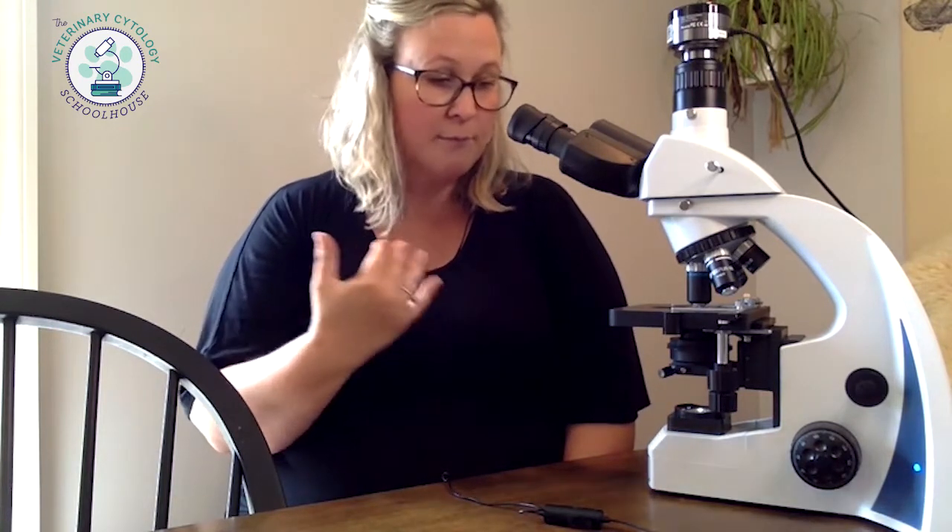I would definitely use this microscope myself, certainly in a clinic setting, but I'm kind of tempted to buy this for my house too. I really like it and I'm going to tell you what I like about it so you can make a good decision for yourself in clinic — it's certainly one I would recommend. So the first thing is that when I got this, it came in a couple of parts.